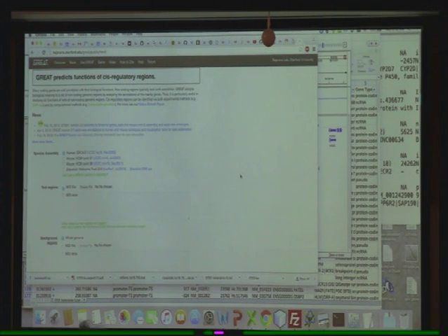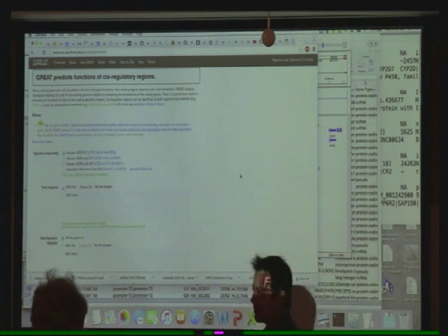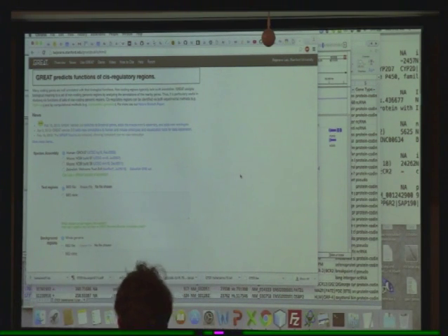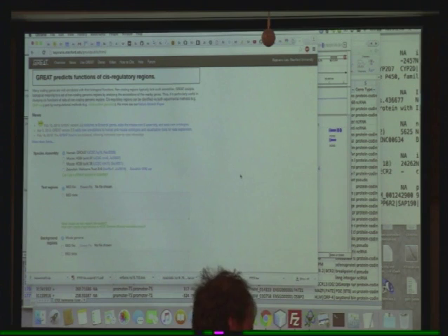And sorry, is that something we generate, or do we have to download all the snaps? Well, what you could do is take your summits, put it into an Excel, and then just delete the two columns. Okay. Because if you upload it to Great, it gives you an error saying there's extra stuff in here.